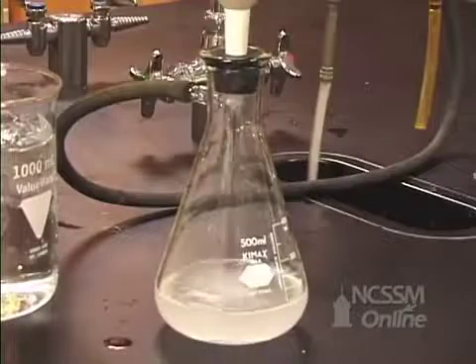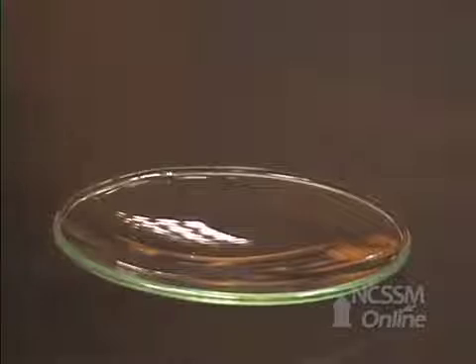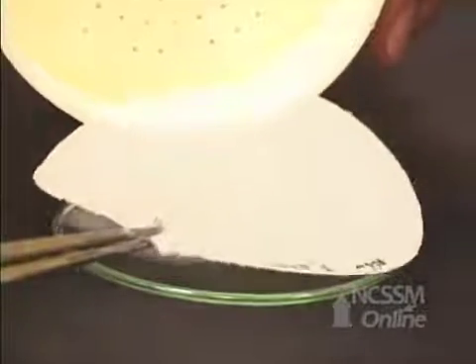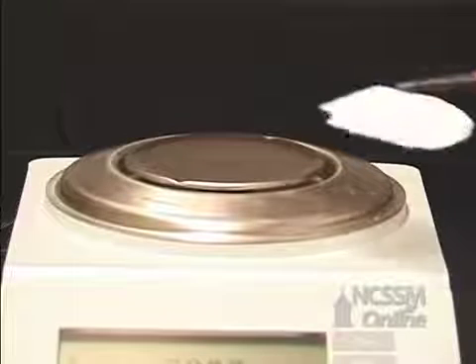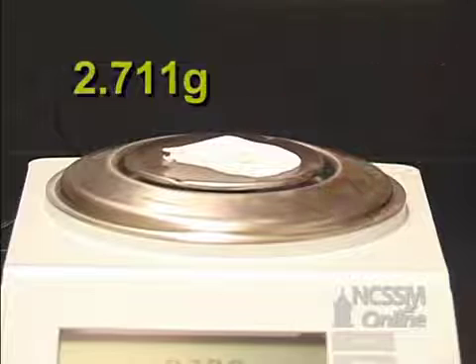Next we want to take out our filter paper with the aspirin on it and set it on a watch glass. Now we have to set it aside and let it air dry. Now we want to weigh our dried filter paper and aspirin sample. This is what one of the crystals up close looks like.